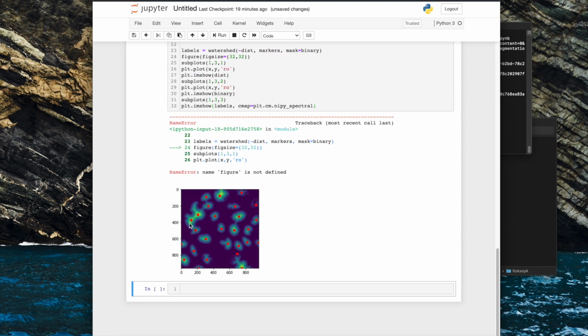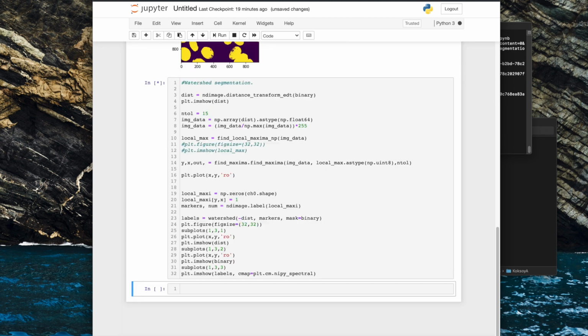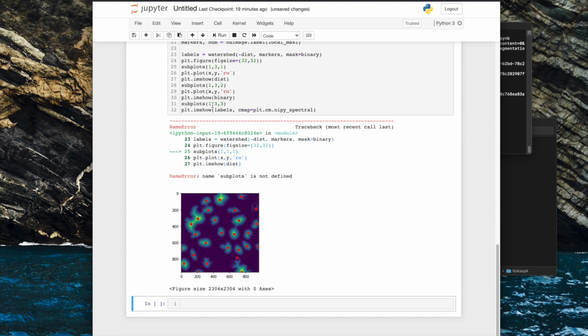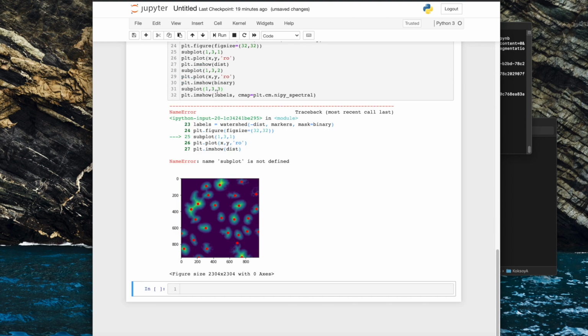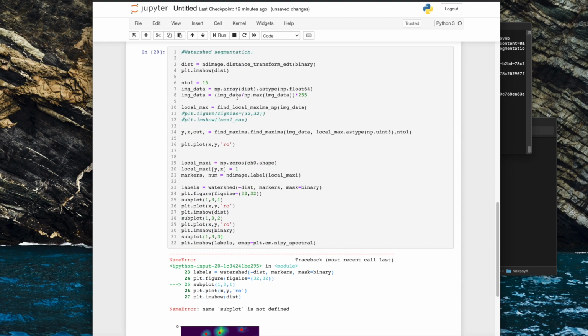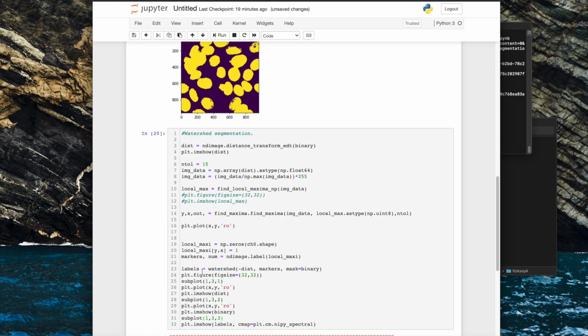Figure is not, there we go, I spelt it wrong. Subplot. No, what am I doing? I just forgot the PLT.